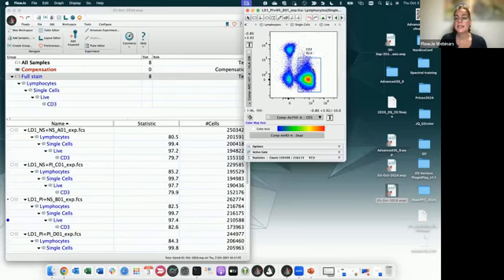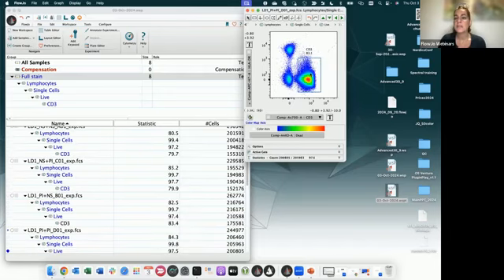And you see that this gate is slightly not completely centered, let's say. So I would either move this gate. And in this case, since my group is not synchronized, I'm only changing this gate. So if I'm going to my next sample, it's still in the original position. If I'm going on to the next sample, it's in the original position, and so on.